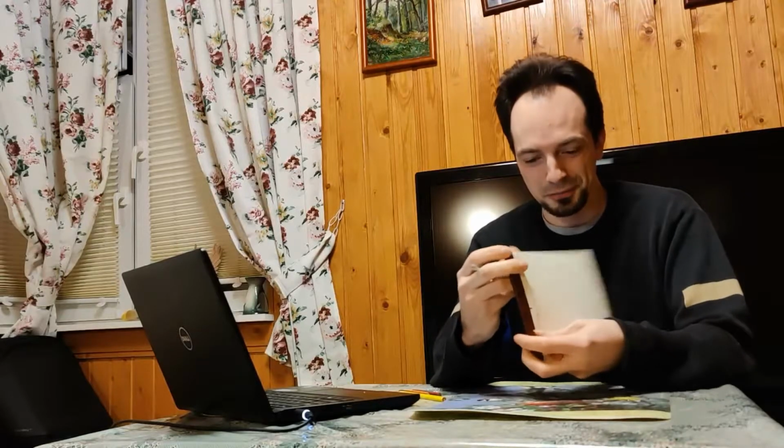So the principle of operation of a scanning electron microscope is quite simple, and I will try to explain it in very brief and basic terms right now using this pen and a notepad.